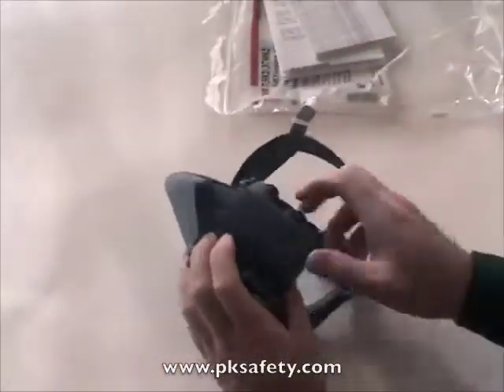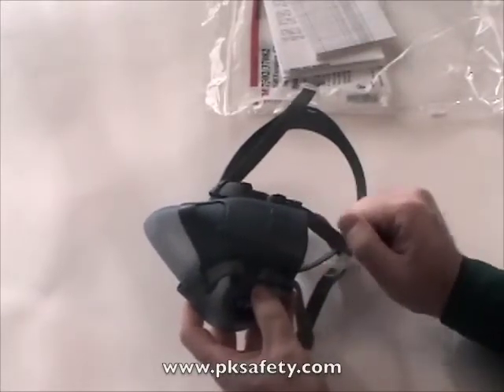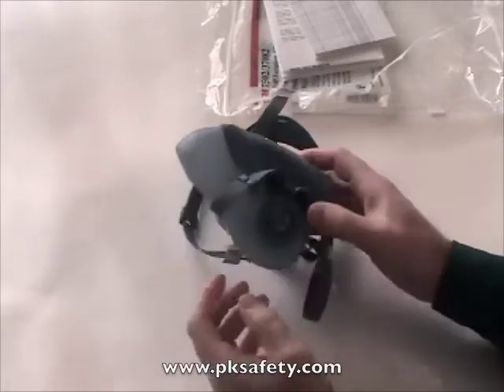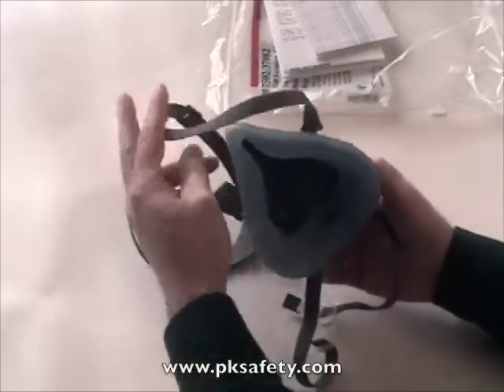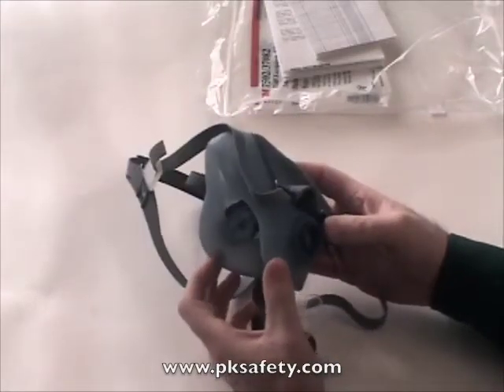The mask features a gray plastic front that houses the exhalation valve and gives the attachment point for the straps. The rubbery part is actually silicone — translucent blue in color, quite soft and very flexible.